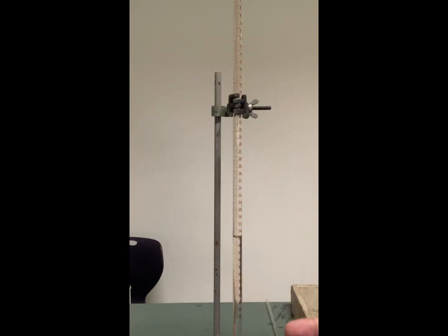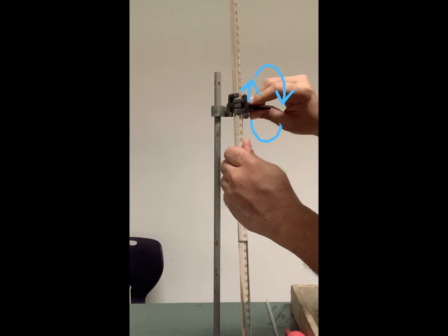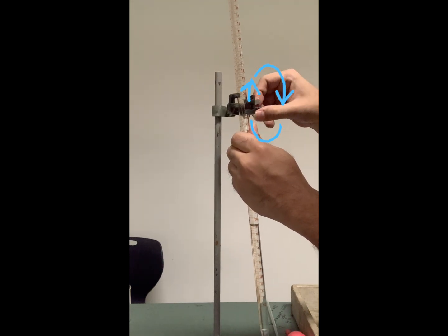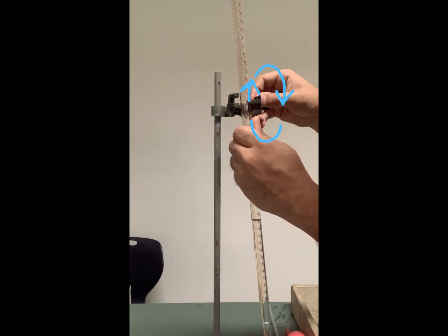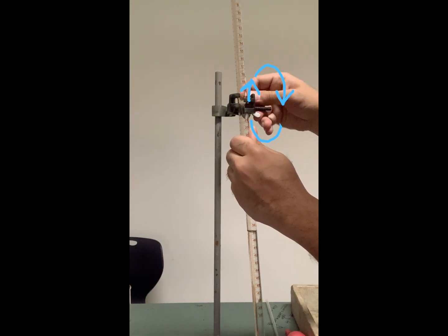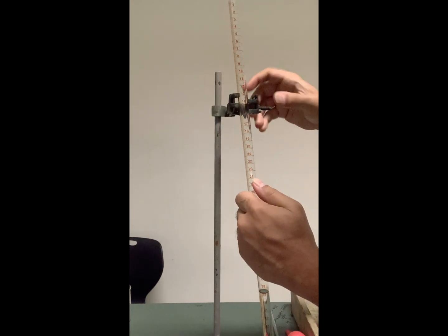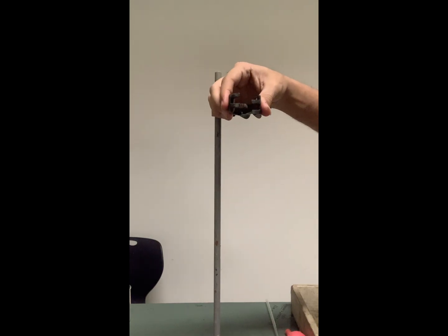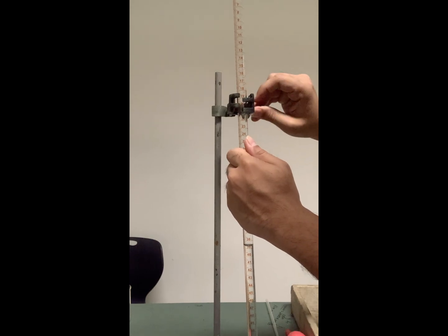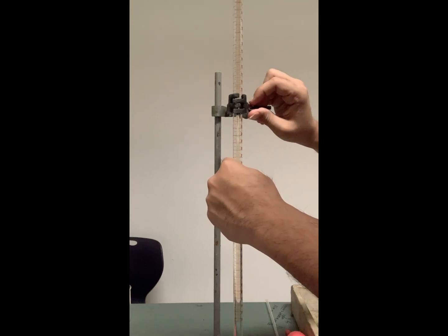There are three important knobs on your burette. The first is this one that you can twist — when you twist it you can see that the jaws of the burette are opening up, which means this is exactly how you open it up. You can take it out and put it back and twist it again. These jaws have to go back and clamp into each other, so you will be twisting it so that these jaws close up and now your burette is fixed.